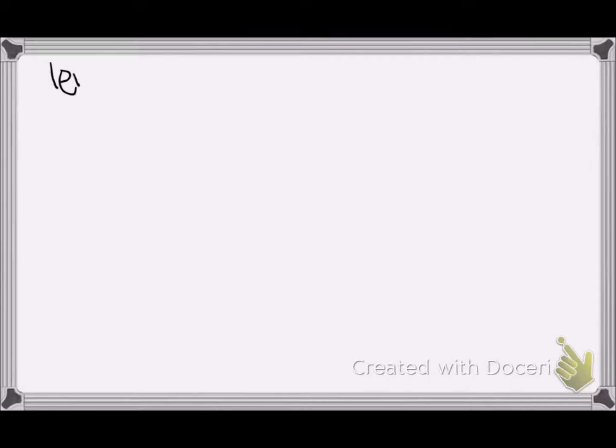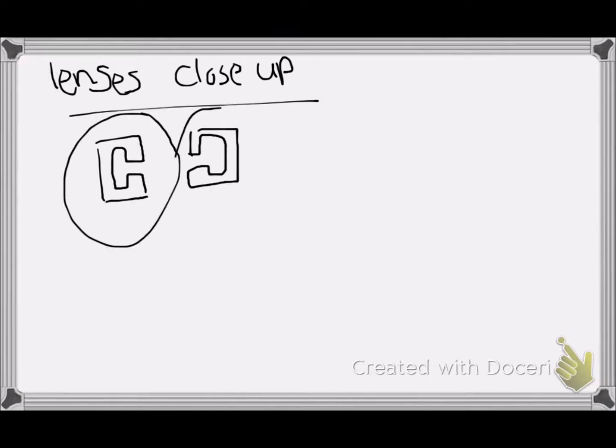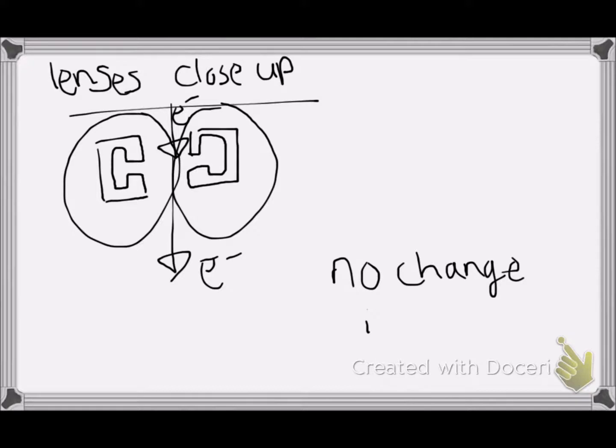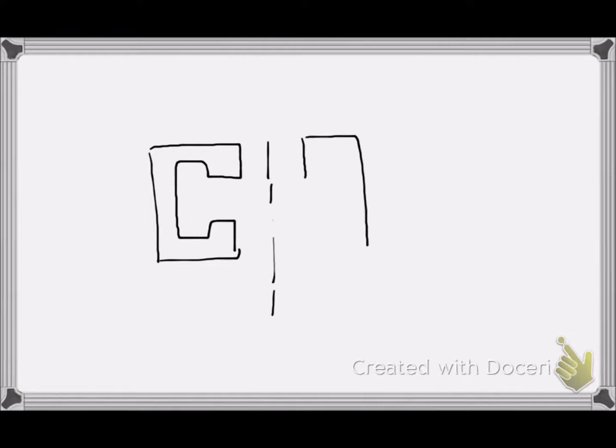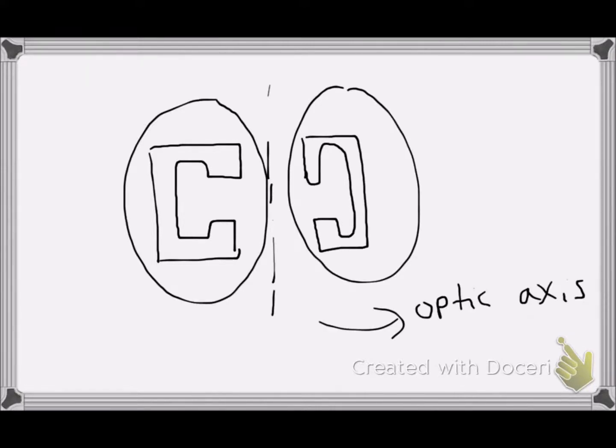So for example, if an electron is coming perfectly on the optic axis, it never encounters this radial magnetic field BR and simply passes straight through the lens without changing direction at all. This is analogous to the optic ray passing through the middle of an optical lens. Let's consider the case in which an electron comes in off-axis. When the electron comes in off-axis, it encounters this radial magnetic field.